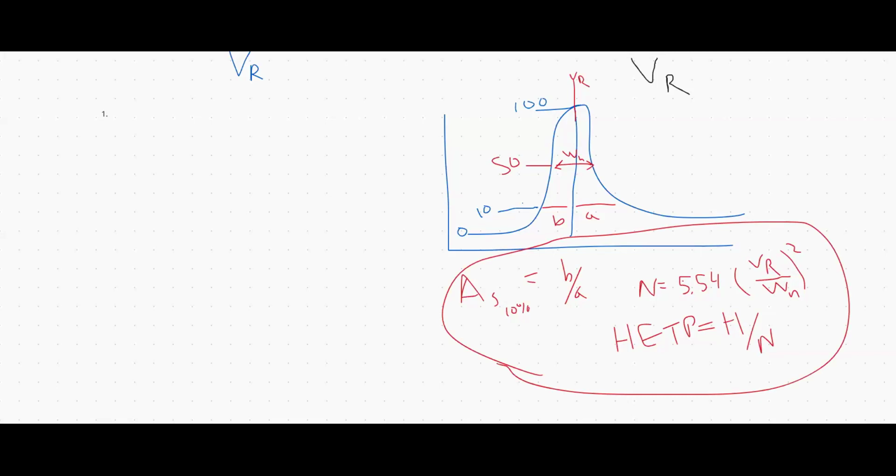You don't really need to know these. Unicorn's just going to do that for you. But if you're like me, when I started out doing the phase transition analysis, I didn't know that Unicorn could take the derivative, so I was doing it in Excel. I was exporting the data and doing it in Excel. So I did use these formulas at one point. And if you're going to use these, I would just double check that I've reported them accurately here.